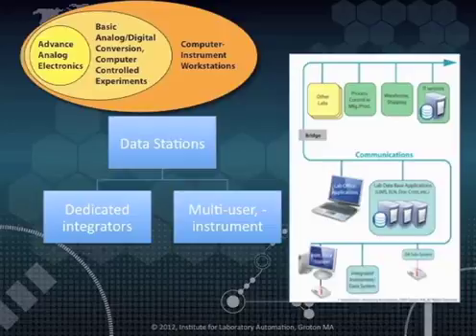The next major stage in the development of computer systems for laboratory work was the development of instrument data stations. In the 1960s, PerkinElmer Corporation began experimenting with computer systems for data acquisition, analysis, and reporting. As we'll see in the section on instrumentation, analyzing instrument output can be a laborious task. Using computer systems to do the work relieves people from a lot of tedious work. We'll be looking at these systems in more detail later.